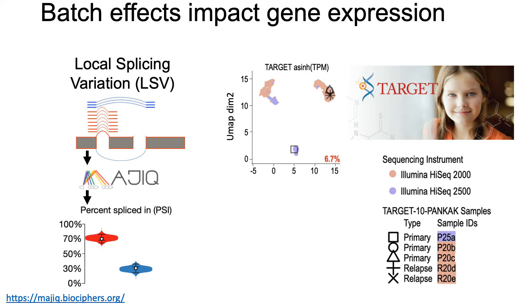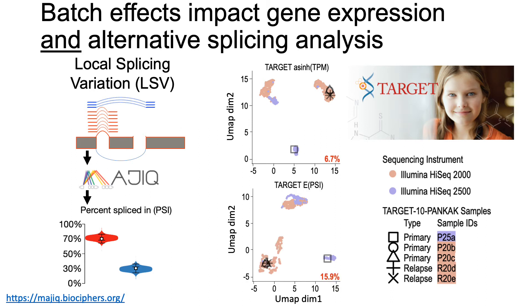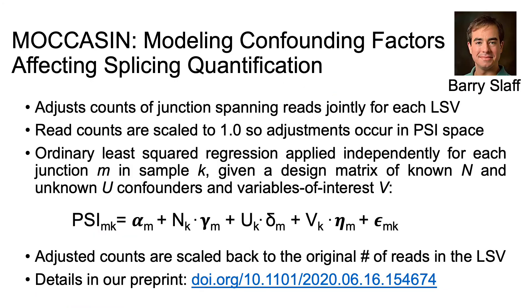When we look at this data quantified for splicing, perhaps unsurprisingly, we see this same batch effect in the splicing analysis too. In fact, it is quantitatively more of a problem because the total variation in PSI attributable to this batch effect is 15.9%, which is over two times more than the batch effect we see in gene expression. So, to address confounding factors in splicing, a former graduate student in Yosef's lab, Barry Slaff, developed MOCCASIN.